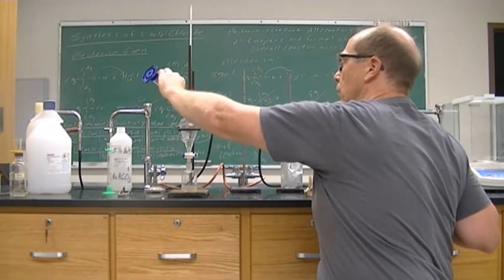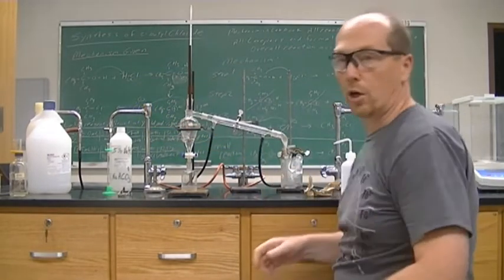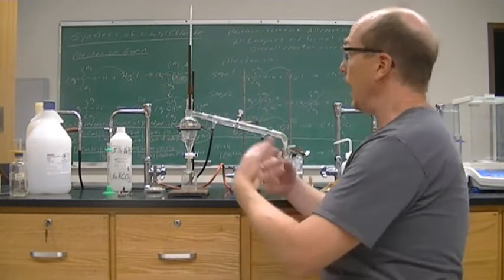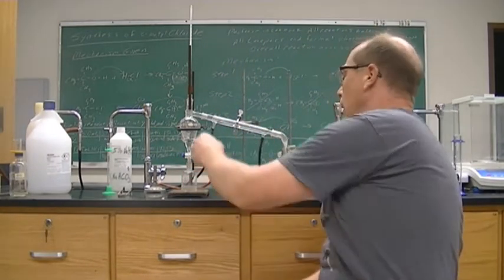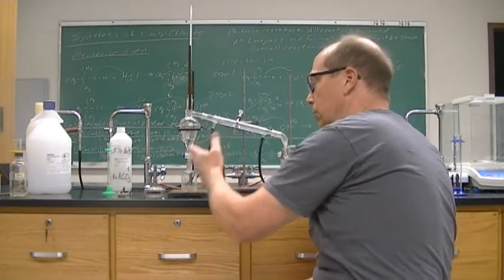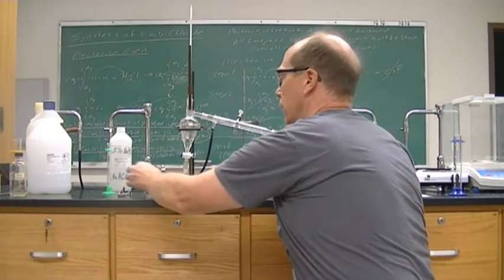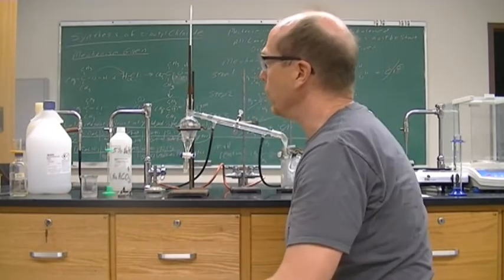All right, so it was hydrochloric acid, our reactant, and we had excess hydrochloric acid. So we're going to wash it. We're going to just dilute the hydrochloric acid. If there's any remaining, it should have all been taken out of this step. But we are going to wash our product.